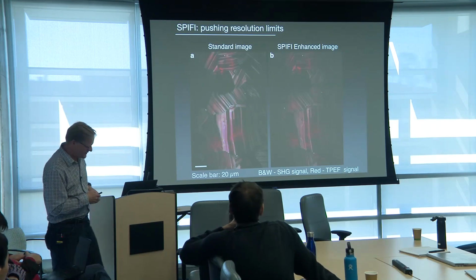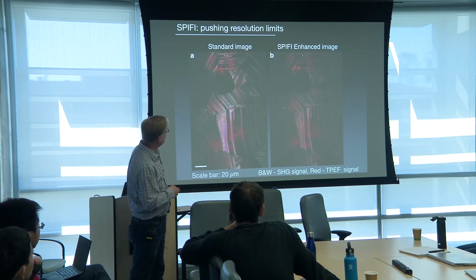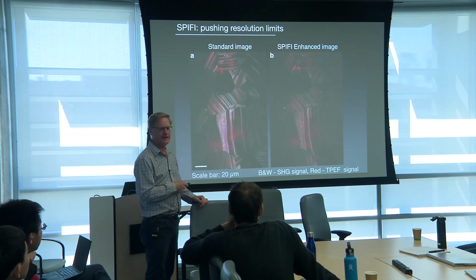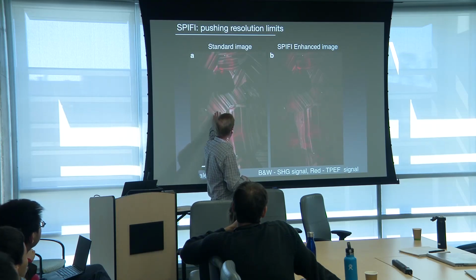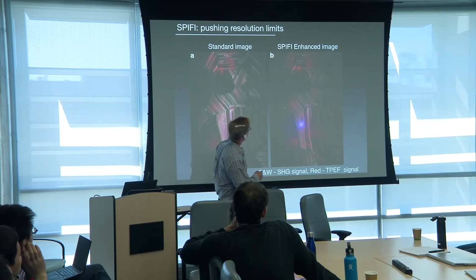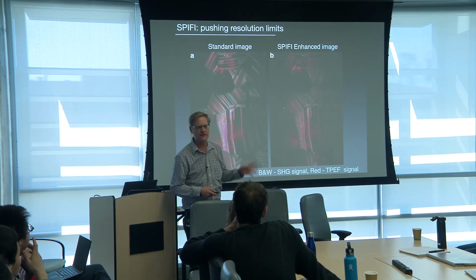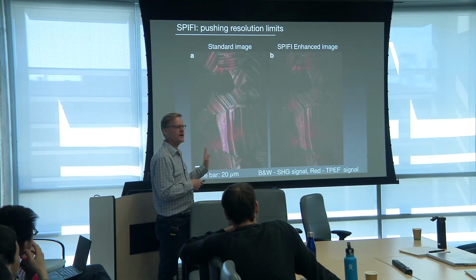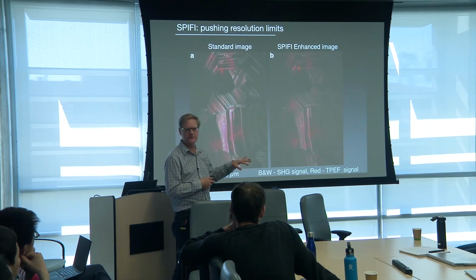And now here, can you see it on this? It looks great on my computer. So hopefully you can kind of see it. You can come up a little bit after. But hopefully what you can see is that, on this guy right here, these layers are pretty blurred out. But you can really start to differentiate all these layers very clearly on what we would call our second order image. So this is where we're picking up a factor of 2.